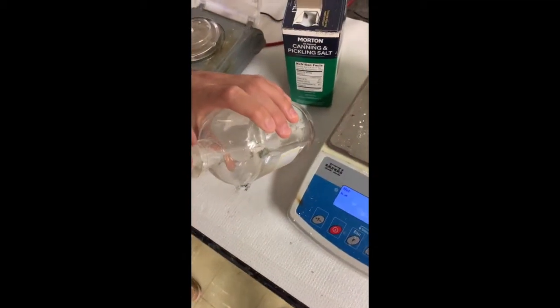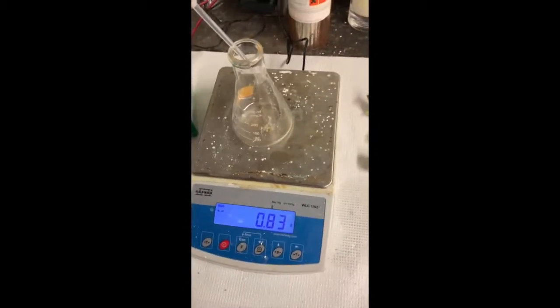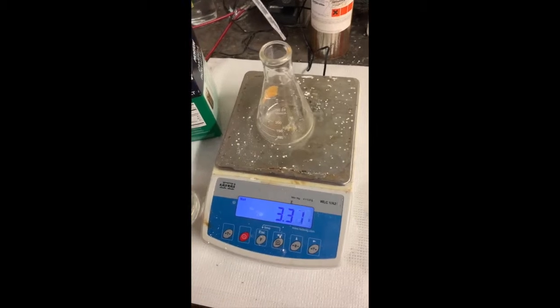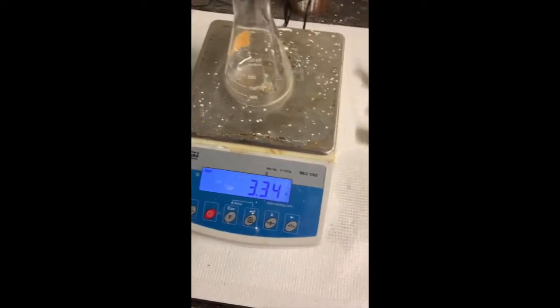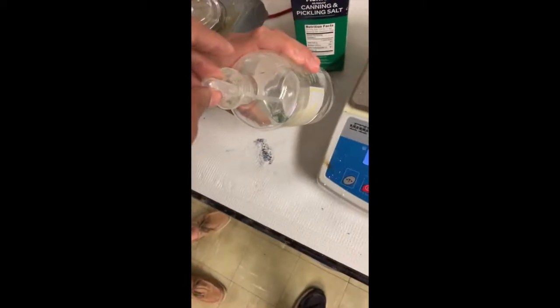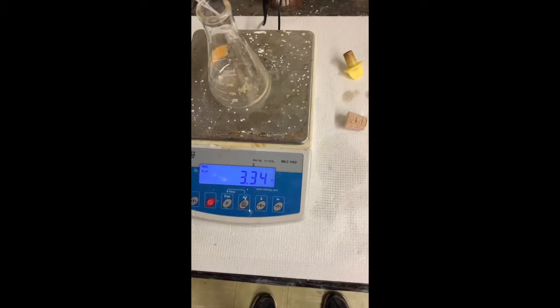Teamwork makes the dream work. That was close. And a little drop should finish it all off. This has to be perfect, you know — science.